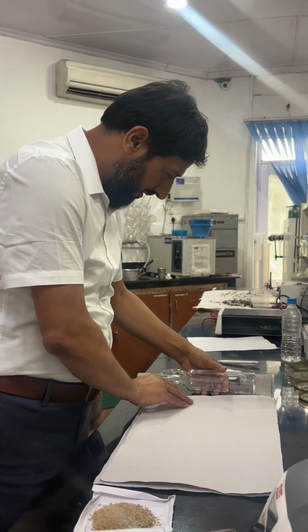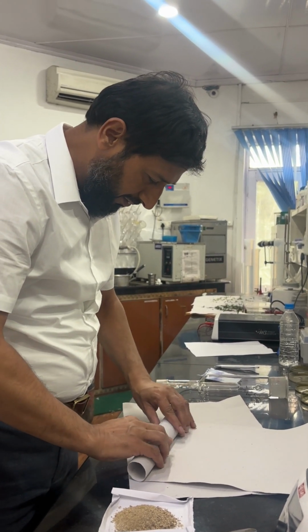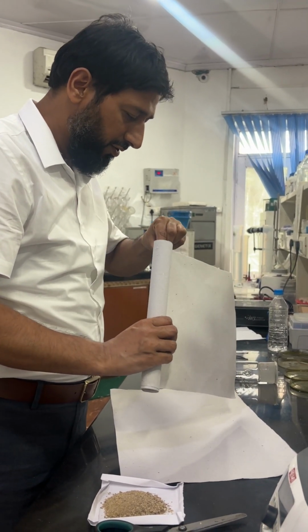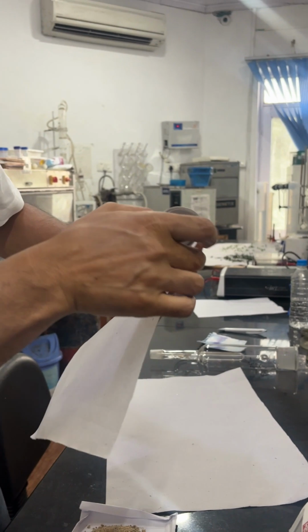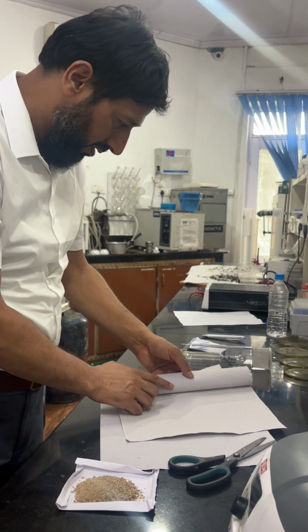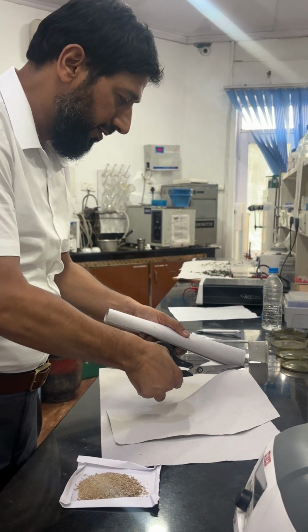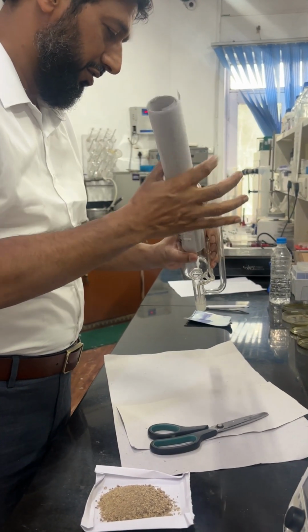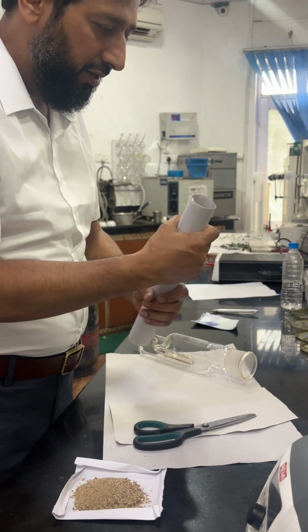So what we'll do, we'll first cut a portion of this and then we'll apply this. 2-3 rows of the double. Now when you see that it's rolled doubly, 1, 2. So we will cut it extra, and then we'll first try it in. Okay, it goes perfectly.